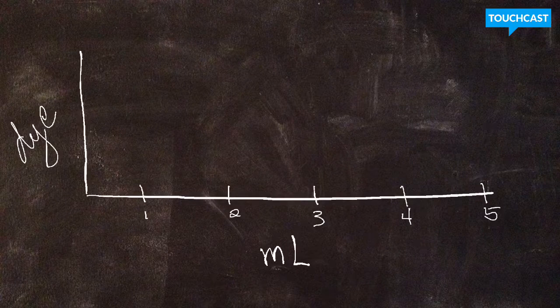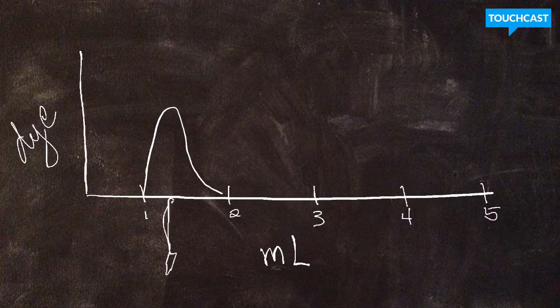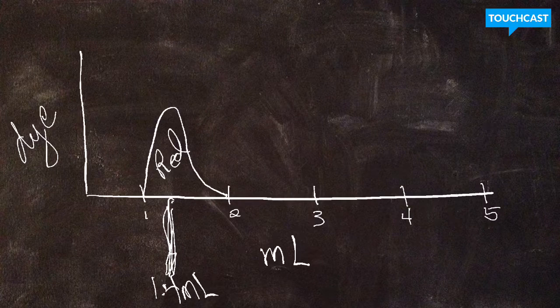Basically, the information that you just calculated is giving you the effectiveness of the separation. So we started to see the red pull out at 1 milliliter, and the center of the bandwidth was about 1.4. This was the center of the bandwidth. If I can do a good job here at drawing, we could say that maybe that first hump looked like this, and this was the red. And you can look in your lab book, right? The center of the bandwidth was about 1.4 milliliters for the red.